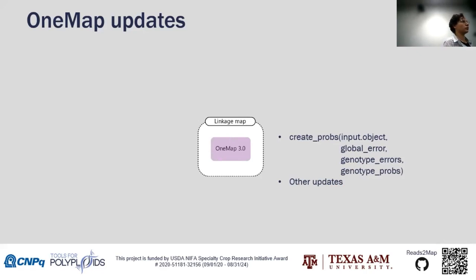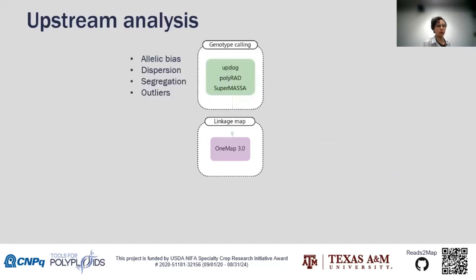Like, why is 5% the best one? Maybe using another type of genotype call was the best. So we started to explore what comes before it, because the quality of the markers will depend a lot on the process of SNP calling and genotype calling. And then there are a lot of softwares and parameters involved.